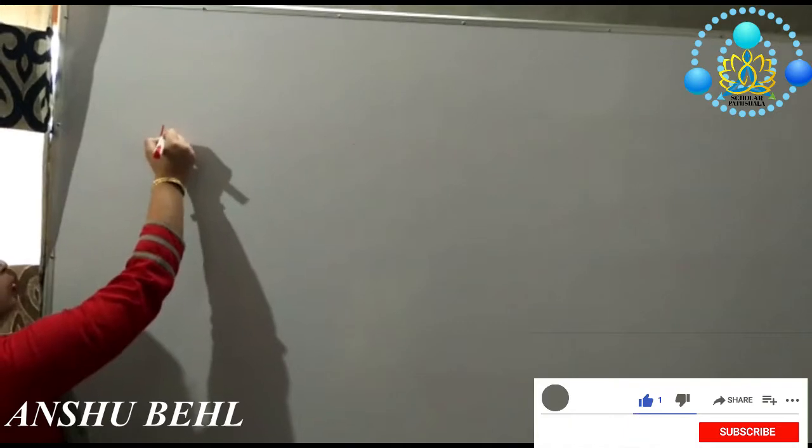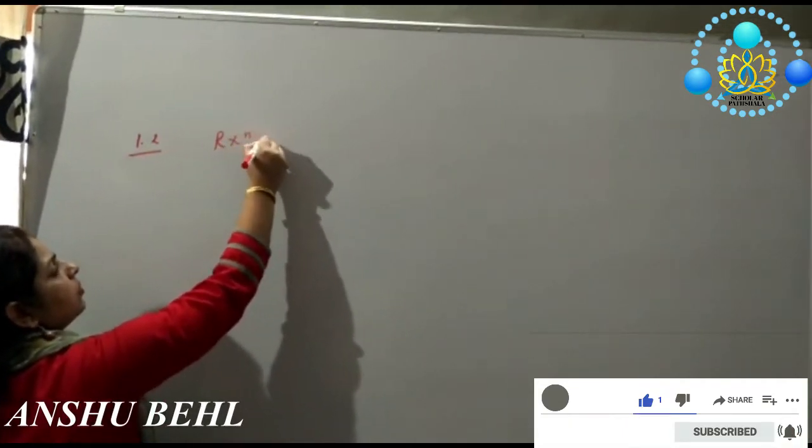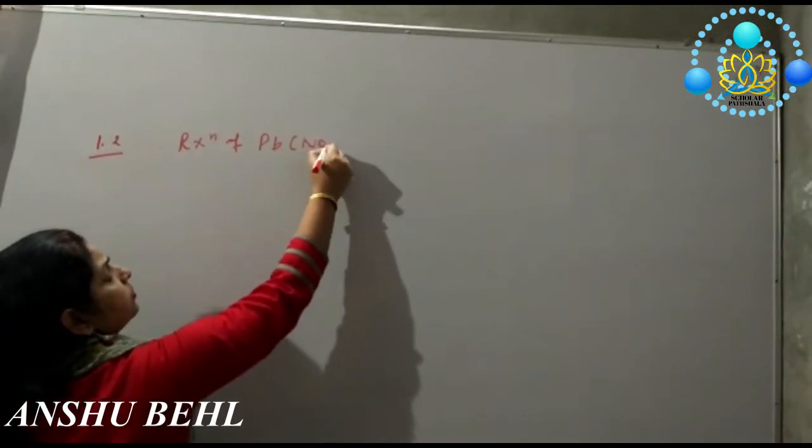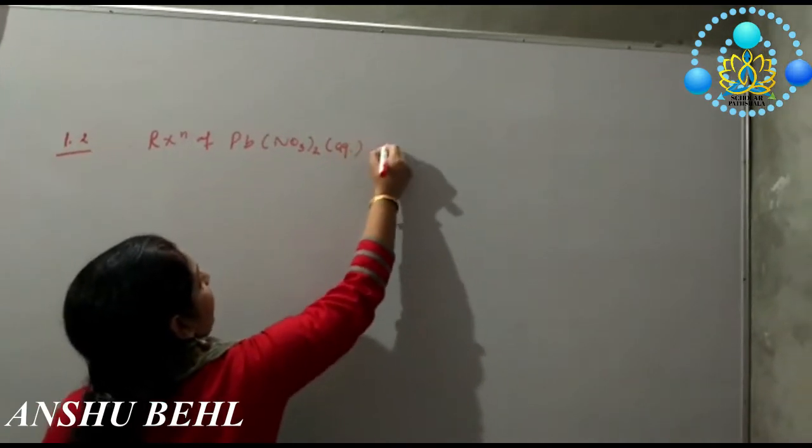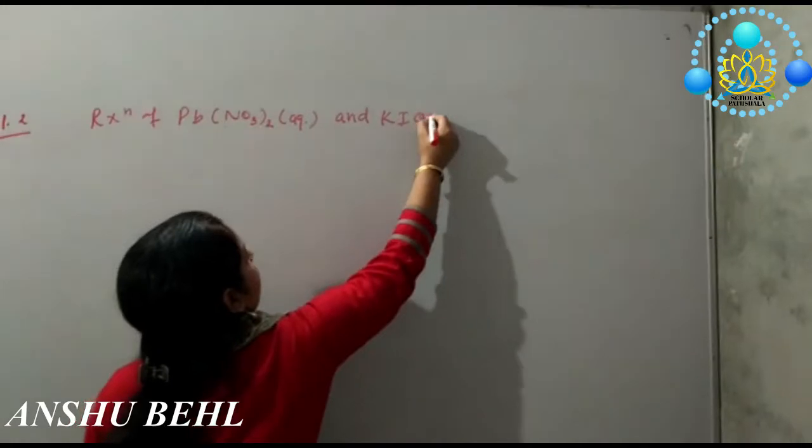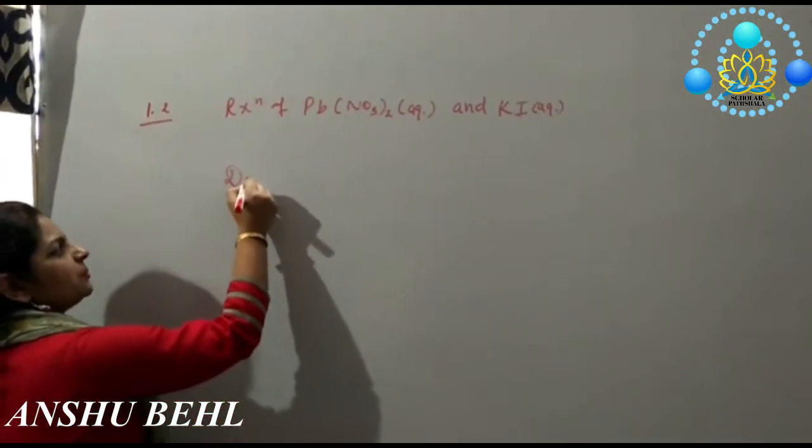Activity 1.2 is the reaction of aqueous lead nitrate and potassium iodide. This is a type of double displacement reaction.